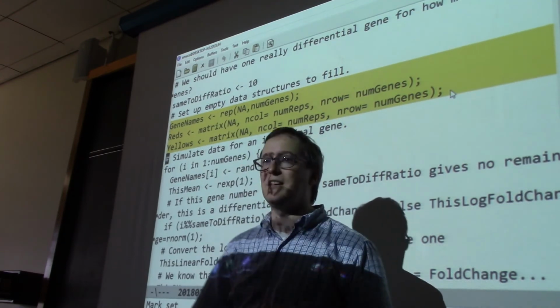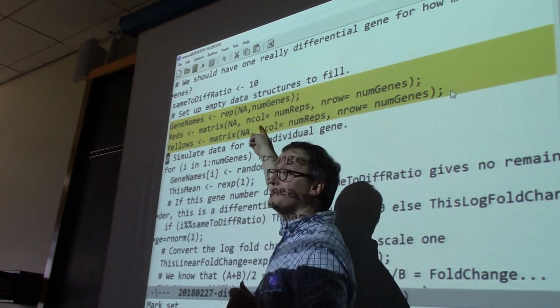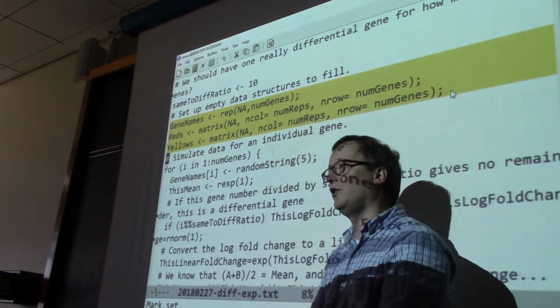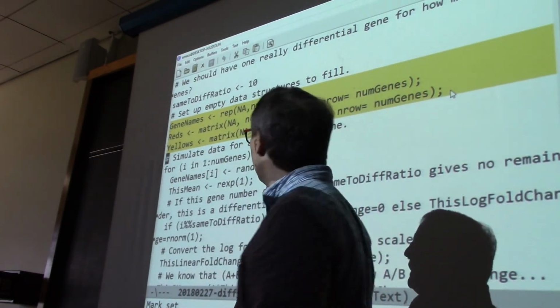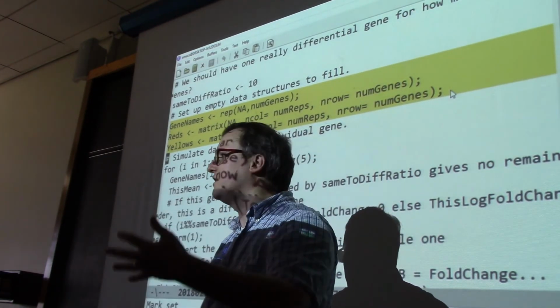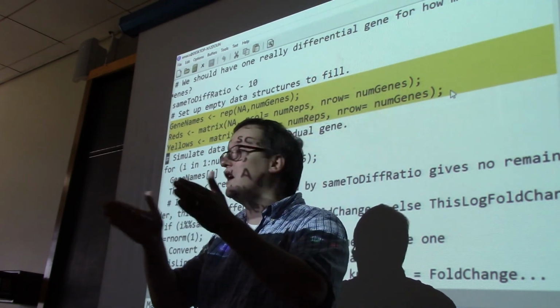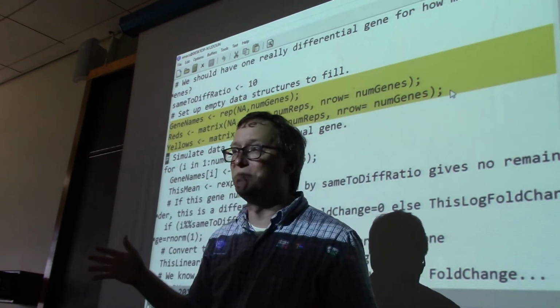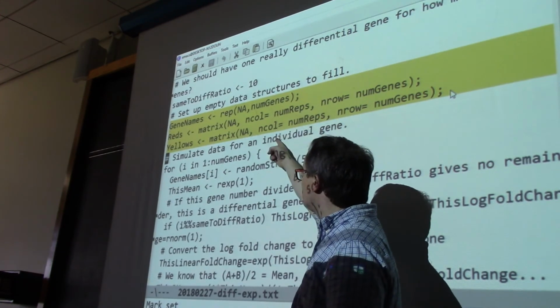Similarly, I've defined reds and yellows as matrices. We talked about those yesterday. I wanted to have 5 columns of them, and I wanted to have 1,000 rows in it. So we've got these 5,000 numbers all nicely formatted, but again, it's filled with NA values. You might ask, why didn't you specify you wanted 5,000 NA values stuck into this? And the reason is I didn't have to, because I already told R that the matrix will be 5 columns wide and 1,000 rows tall. So it's simply going to repeat NA until it has all of them filled. That's one of the rules for doing these inserts. And I do exactly the same for yellows.